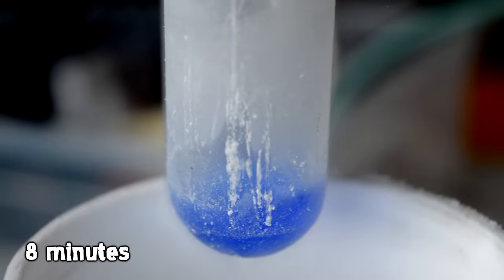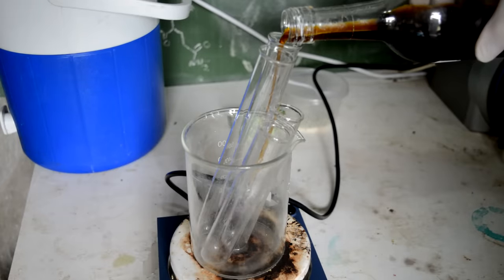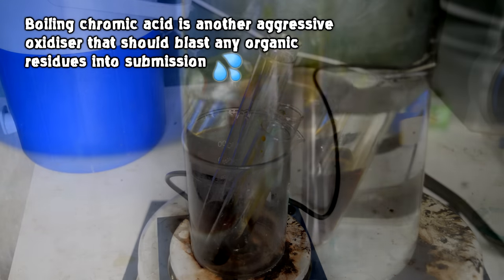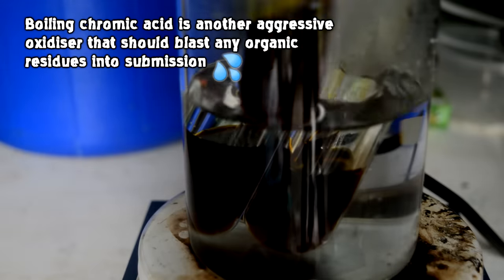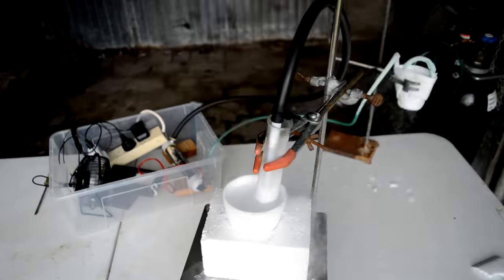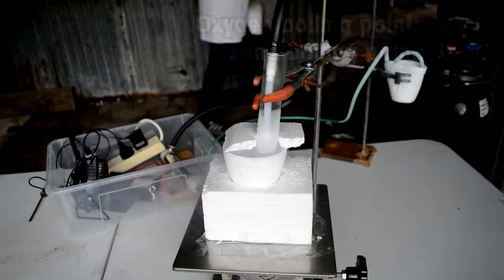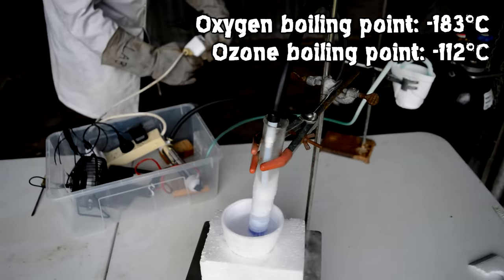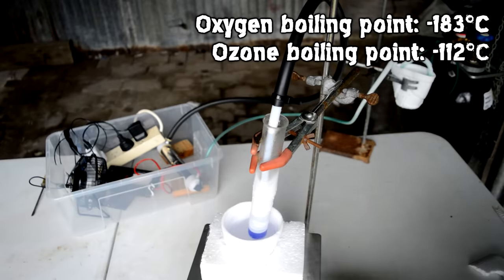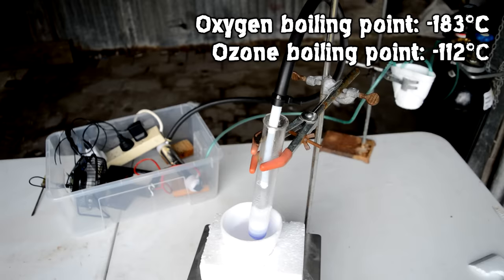It's worth pointing out that I did thoroughly clean the glassware with chromic acid before pumping ozone into it, so hopefully that ozone stays around rather than reacting with or blowing up with any contaminants on the glassware. I ran the generator for about 10 minutes and then turned it off and took it out of the liquid nitrogen very carefully. Ozone has a higher boiling point, so if we just let it warm up, theoretically we're going to preferentially boil off the oxygen and the ozone concentration will further increase before boiling off itself.